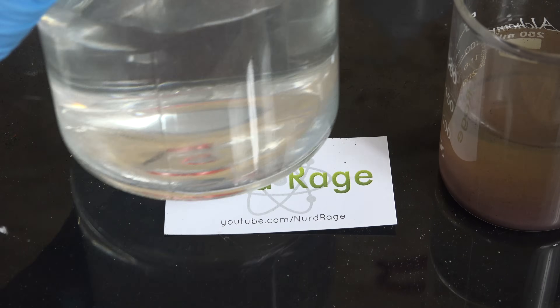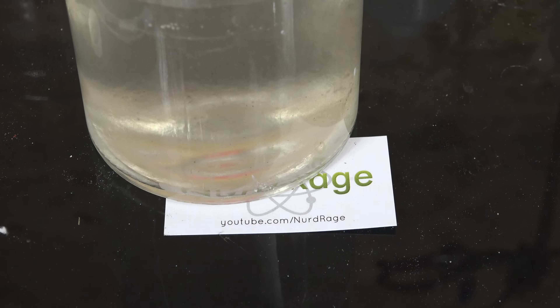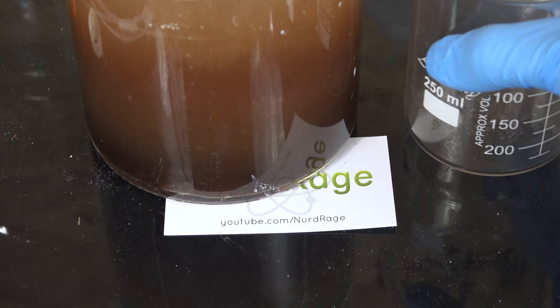For safety, to quench the reaction when you're done, take the whole beaker and dilute it into several times its volume of water. Be careful though, as it can still catch fire as you're pouring it in.